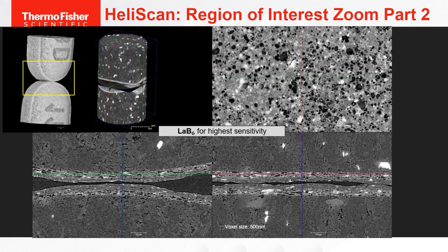This plays into the 4-dimensional aspect as well, because if you want to watch what happens to this material over time under different perturbation or different environmental conditions, then you would watch what happens to these scans over time in terms of not only their high density particles, but also the lower density API information at high resolution, before you go down to the destructive modes that Robert was talking about in the nanometer scale.